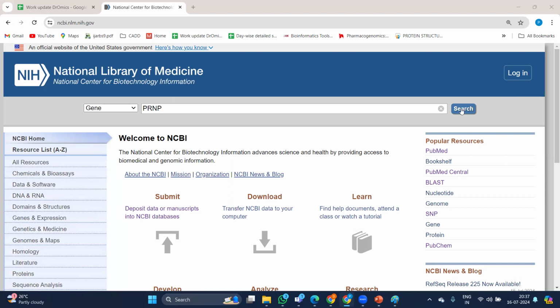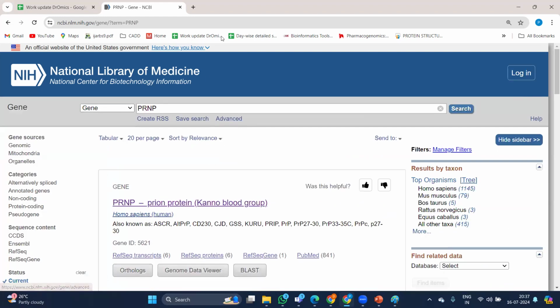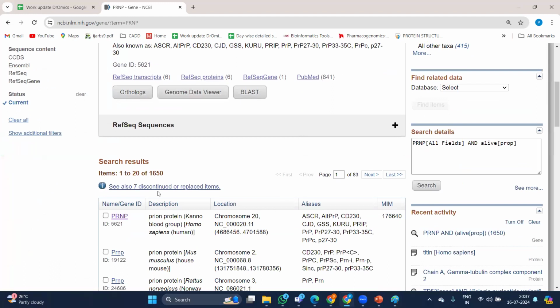1650, 1145. Okay, I'll search for it. We are having 1650. Maybe some kind of filters you might have applied, ma'am. Try to check it once.